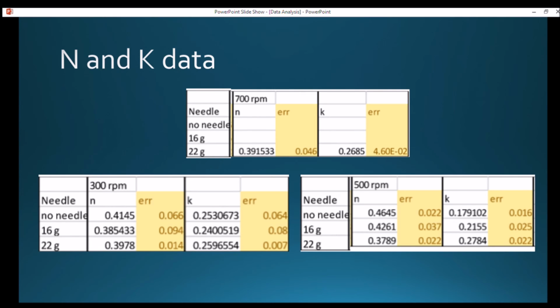And another problem with the needles is that we attempted to do drop-wise dispensing, but you need to dispense the beads quickly so that they all have a cross-linking time of 5 minutes or close to it. It is possible that we weren't dispensing beads quickly enough, or they were formed with different radii, and that changes the surface to volume ratio.